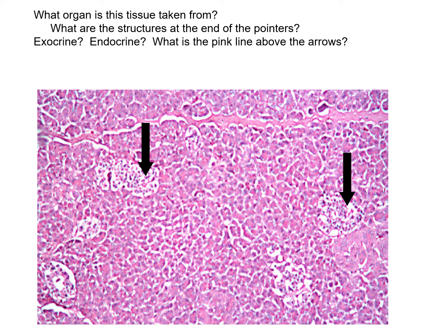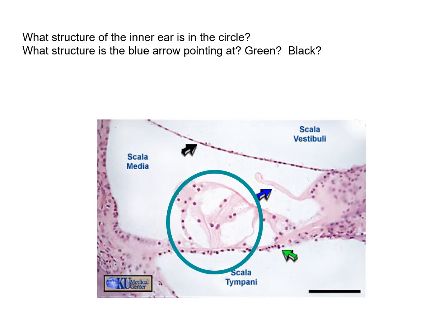The pancreatic duct. Correct. And what hormones does it release from the islets? Insulin and glucagon. To name two, yes. And somatostatin. To name a third, yes. There are more, but those are the biggies.